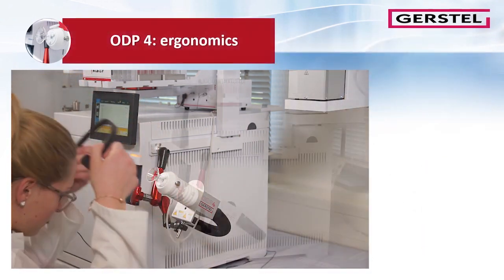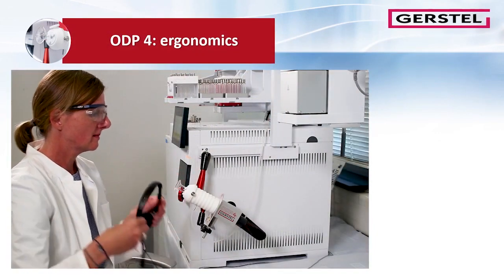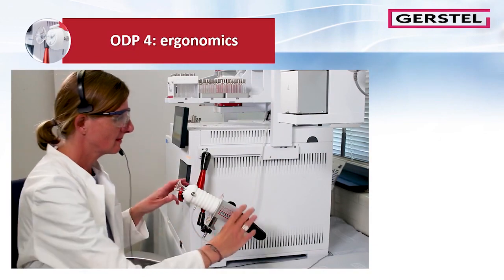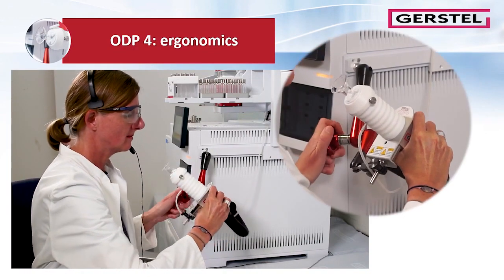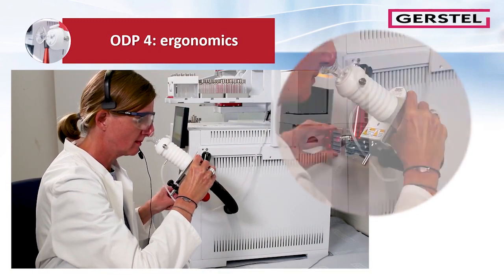The ODP can be optimized for individual preferences in terms of ergonomic position, flows and humidity. Easily conforms to the analyst's preferred position through flexible heated transfer line and support arm.